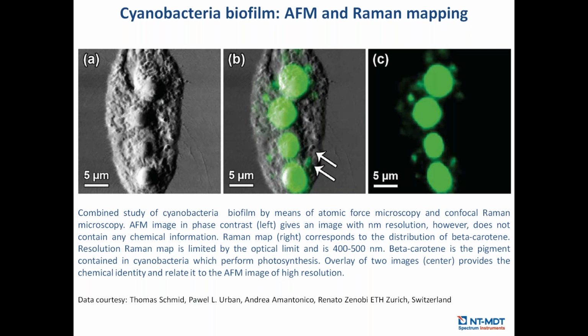Okay. Another question is, can you make imaging of live cells? I mean, in a liquid solution. Yes, it is possible, AFM in combination with Raman.